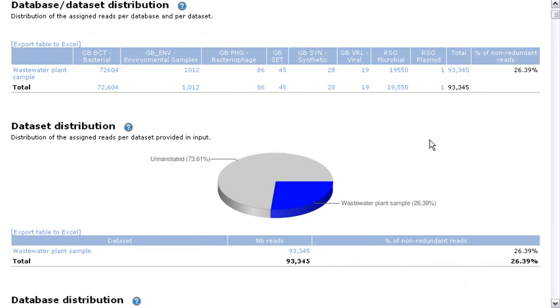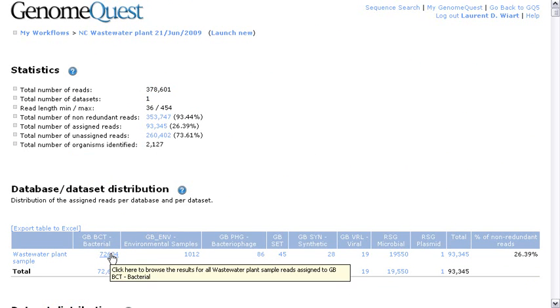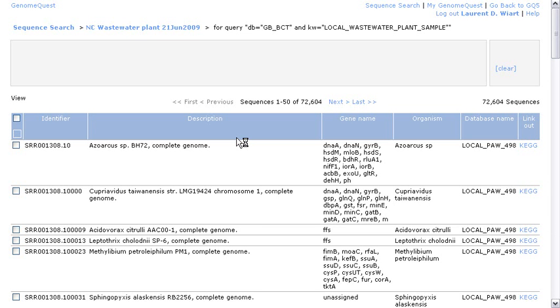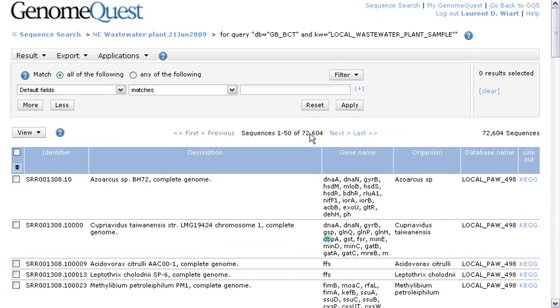Now, if I want to drill down into some of the specifics of this experiment, for example, the bacterial reads or the reads annotated by bacteria, I just have to click on this link. And now we are browsing the 72,000 reads annotated by sequences from GenBank bacterial division.